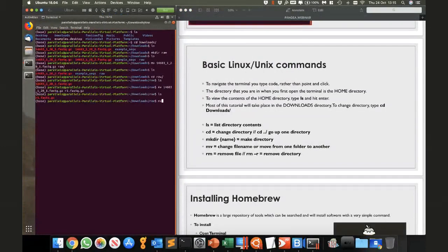So what we'll do is we'll just move this back to the directory above. Another neat trick, you can see here that I've typed in cd space .. which basically means go up one directory. So here I'm going to move r1.fastq.gz up one directory and then hit enter. And now just to double check, go ls again, and we can see there's now nothing in this directory. So we'll go up one directory, and now here you can see here's my r1.fastq.gz, and here's my other two directories.